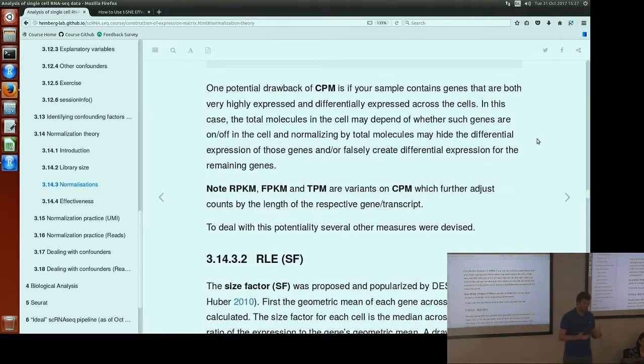So to build in this idea that if you have a longer gene or a longer transcript and you're sampling reads from the full length of the transcript, then you would expect to see more counts coming from longer genes or longer transcripts. And so that makes it very difficult inherently to try and compare expression values between genes that have very different lengths.